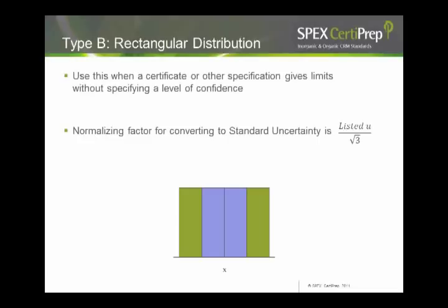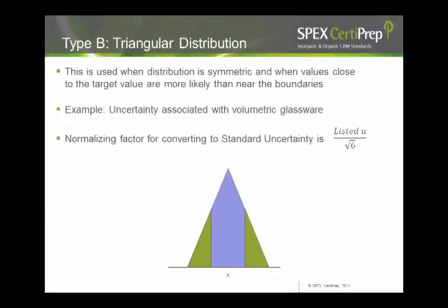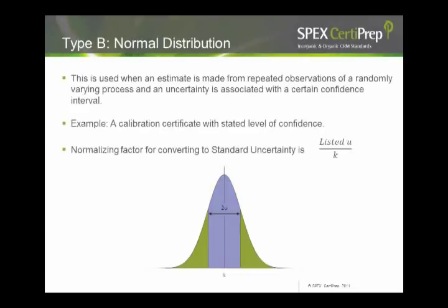So at this point, it is important to distinguish between error and uncertainty. A few slides ago, I had mentioned various errors. Those errors you can combine into a single value. We cannot know exactly what the value is. However, we can estimate the uncertainty. So uncertainty estimation is simple in principle. As a first step, we should have a clear idea of what is to be measured. Then you write down all the various processes involved in your measurement. You will be identifying sources of uncertainty within this process.